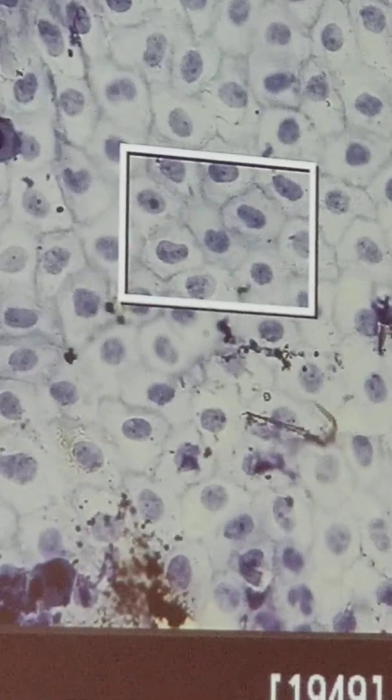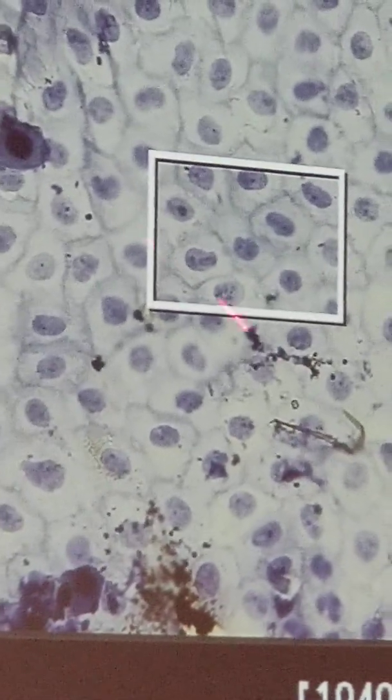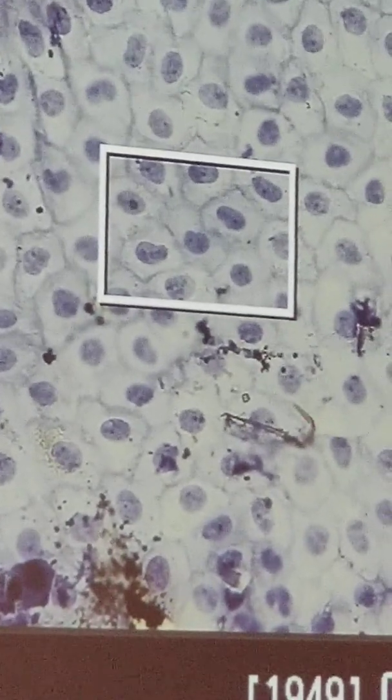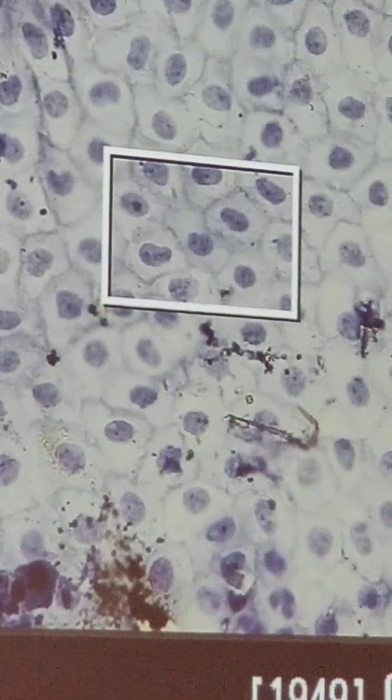Don't cross arrows on your drawings ever, okay? It gets too hard to follow. Trace them out. What's all this stuff? It's just remnants, extra stain, and different things like that. Stuff that got on the slides, on the tissue samples before they stained them, and that sort of stuff. So that's what you need to do with that. That's how you find out. Okay, next up, let's go to the next one.